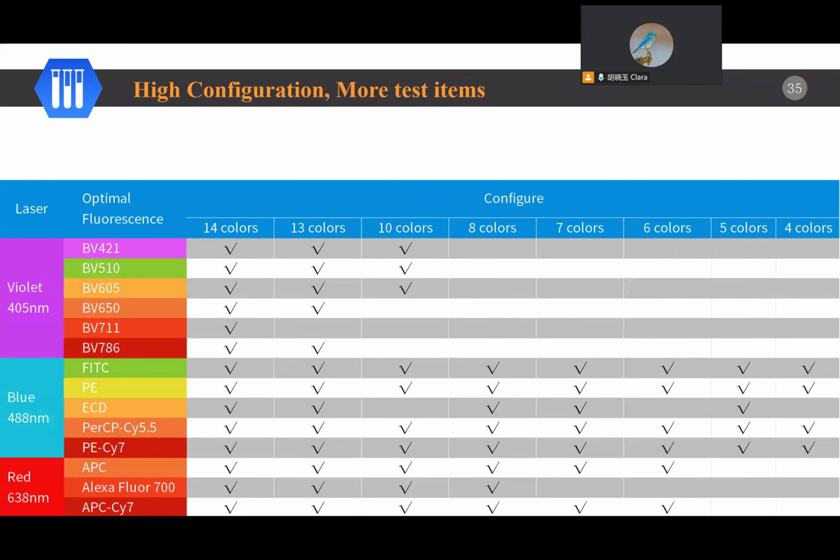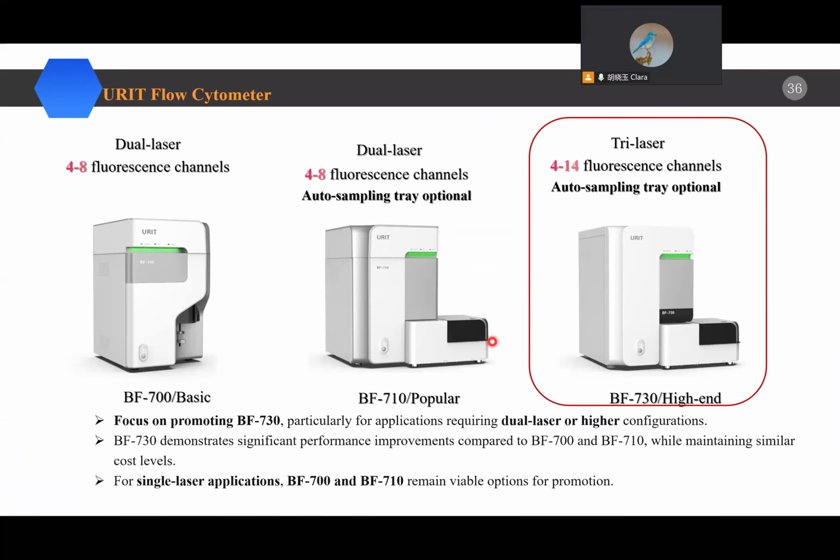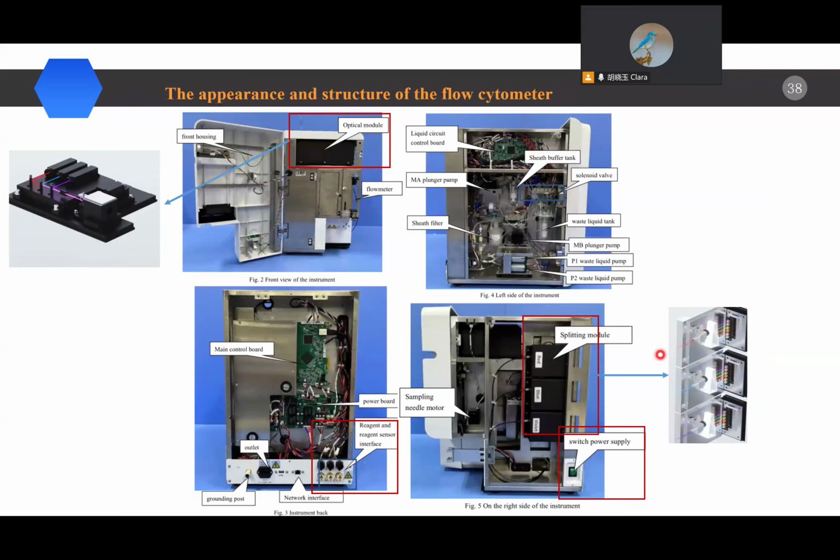Okay, the configuration here we already learned. And this is the flow cytometer here. This is the inside look, or the structure, of the flow cytometer that you may care more about, but I copied these pictures from the service menu. You can check it later.